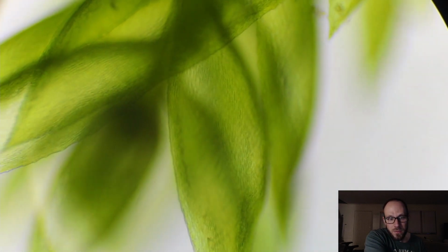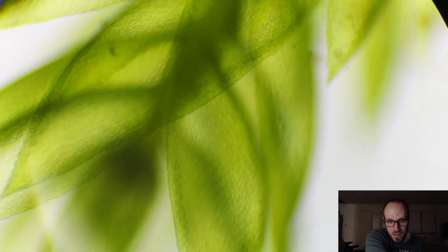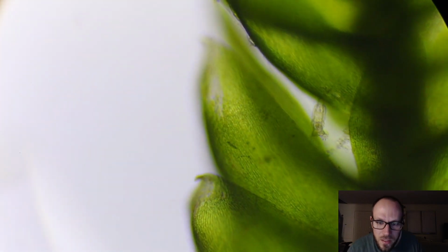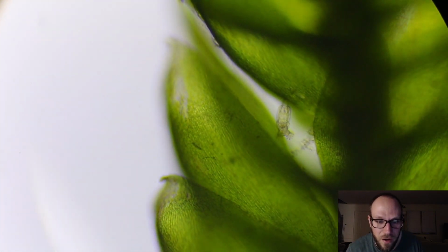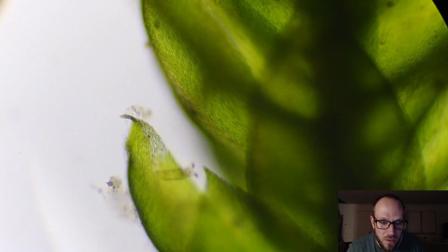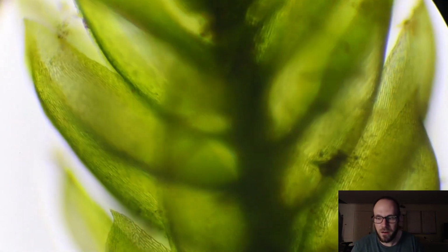And yeah, so here's a piece of the moss. You can see the cells on it. We're at 100x right now. Try to get a... I noticed that these rotifers are everywhere on this slide. That's why I love it so much. There's another one. They're just everywhere.